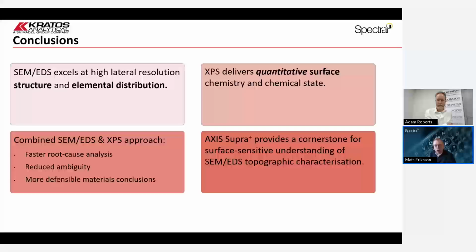And it depends on what you're looking for. Exactly. That's where I always start getting excited about the surface. A lot of things like adhesion or catalysis, that's where the action happens. It's really that very surface adsorbate level that you want to characterize from the application of the material for a particular purpose.